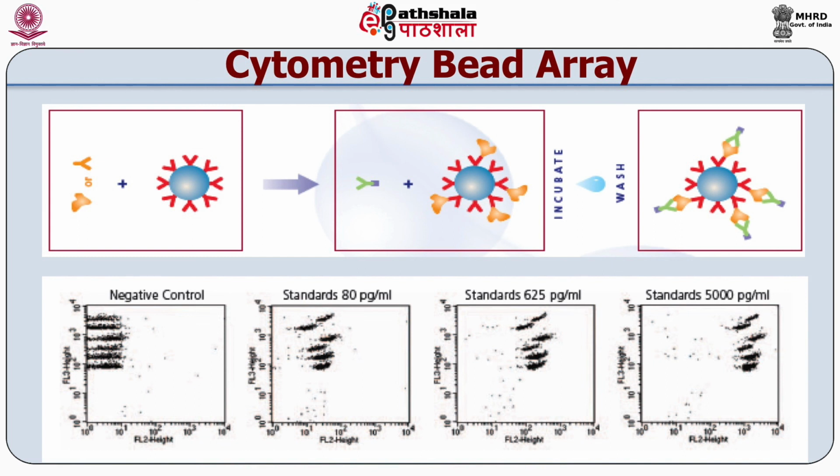After incubation with the patient's serum, beads with antigens bound to the surface can be detected with fluorescein labeled antibodies. Using this, a wide range of molecules such as hormones, cardiac markers, therapeutic drugs, drugs of abuse and blood-borne viruses can be measured.